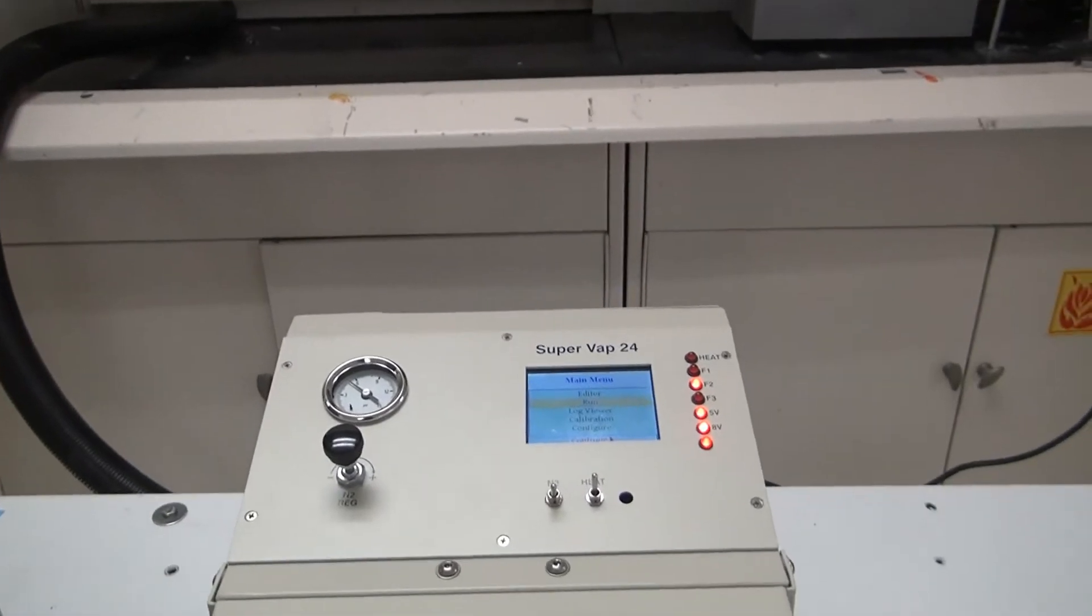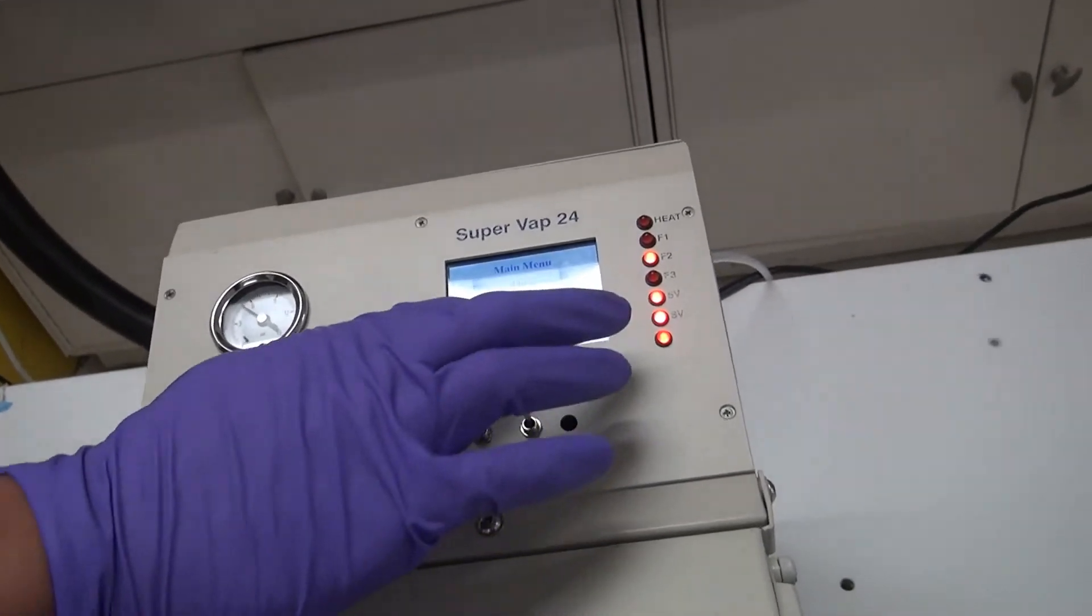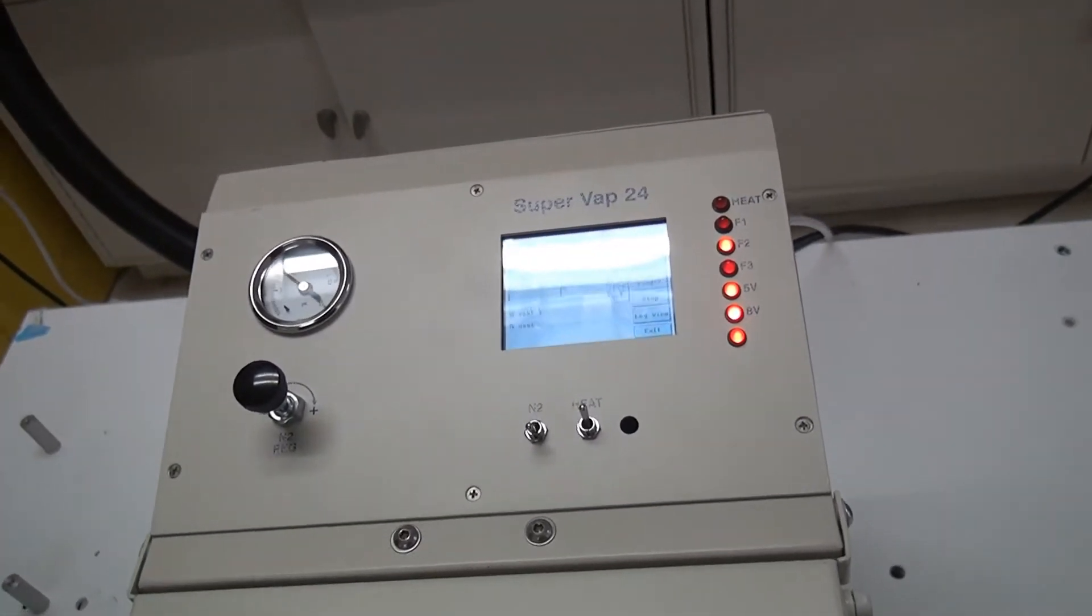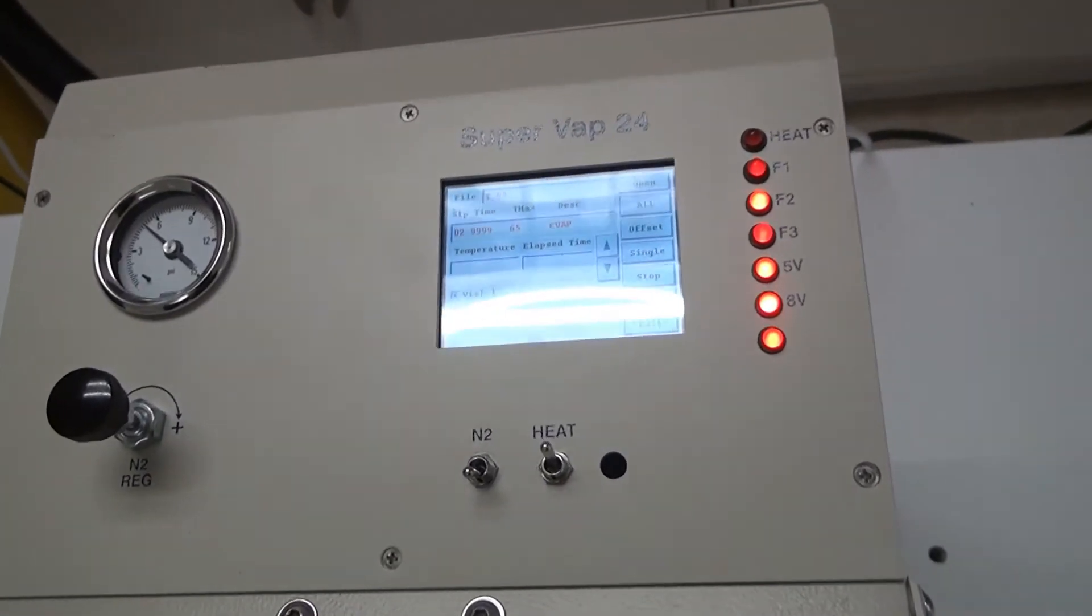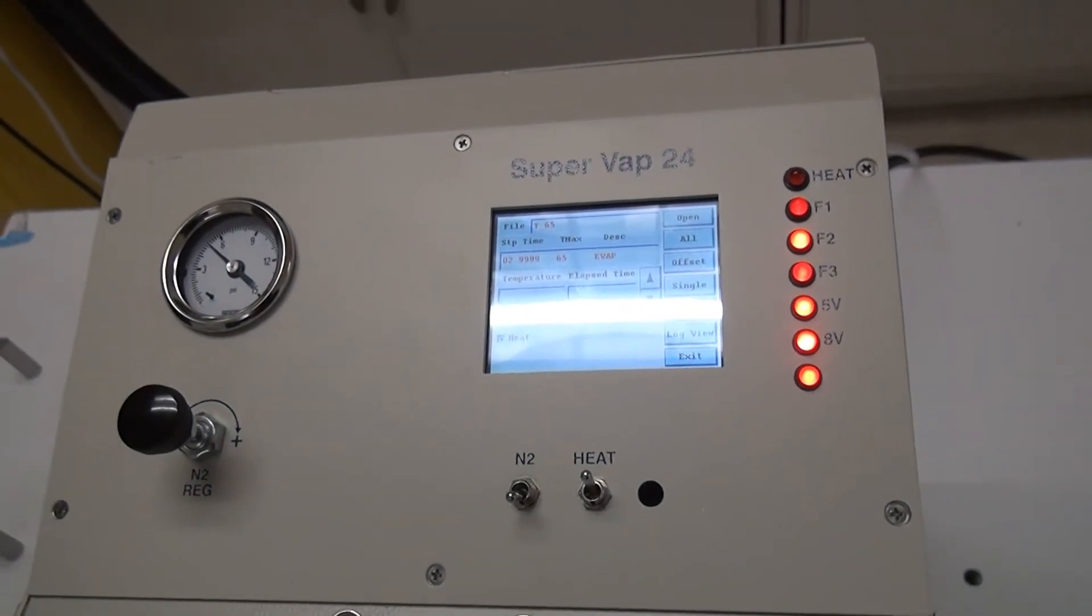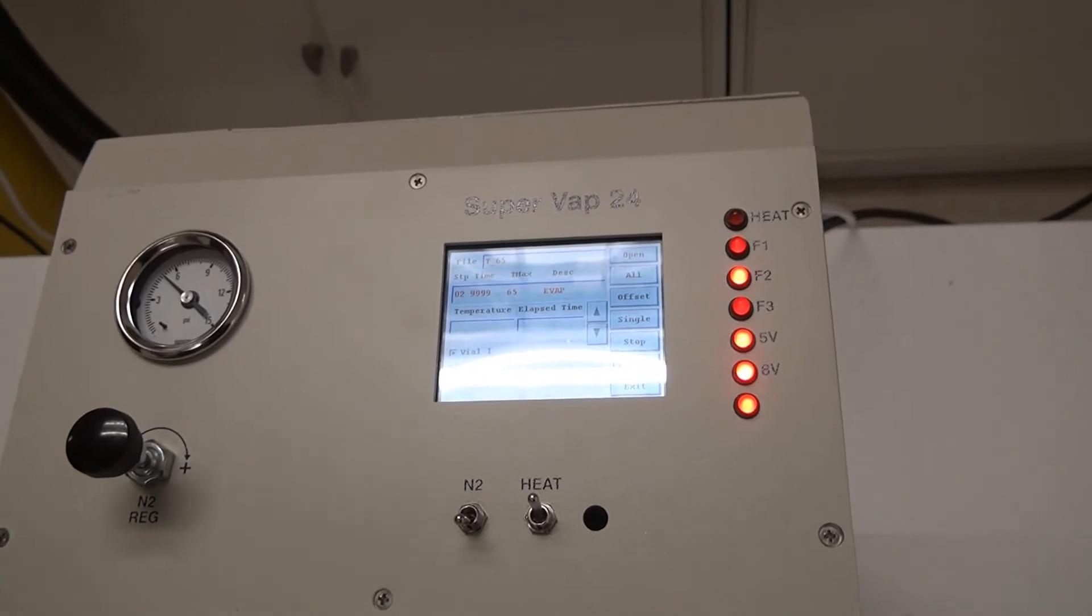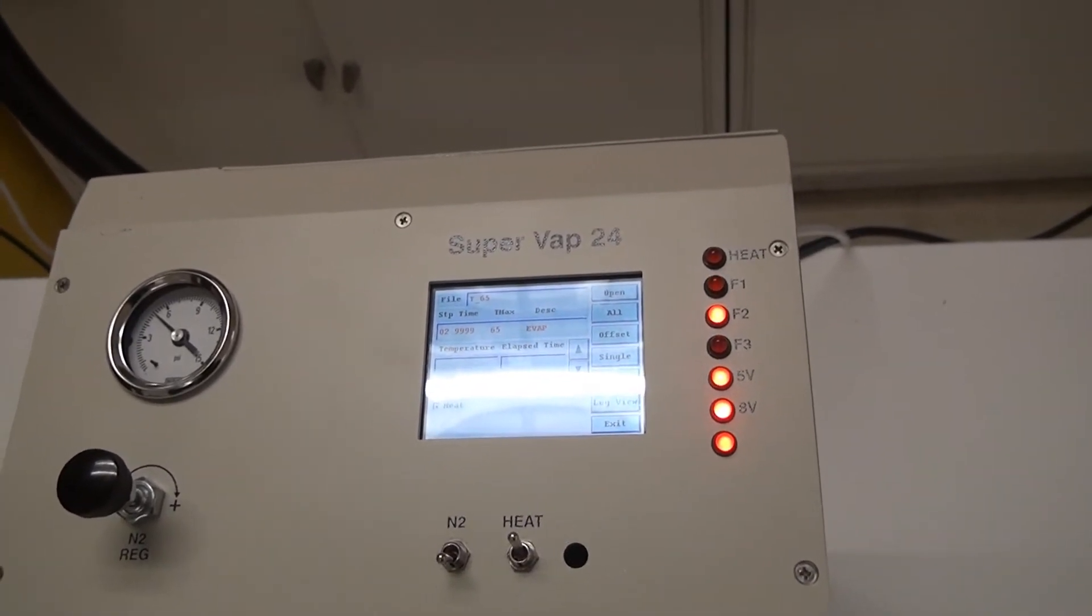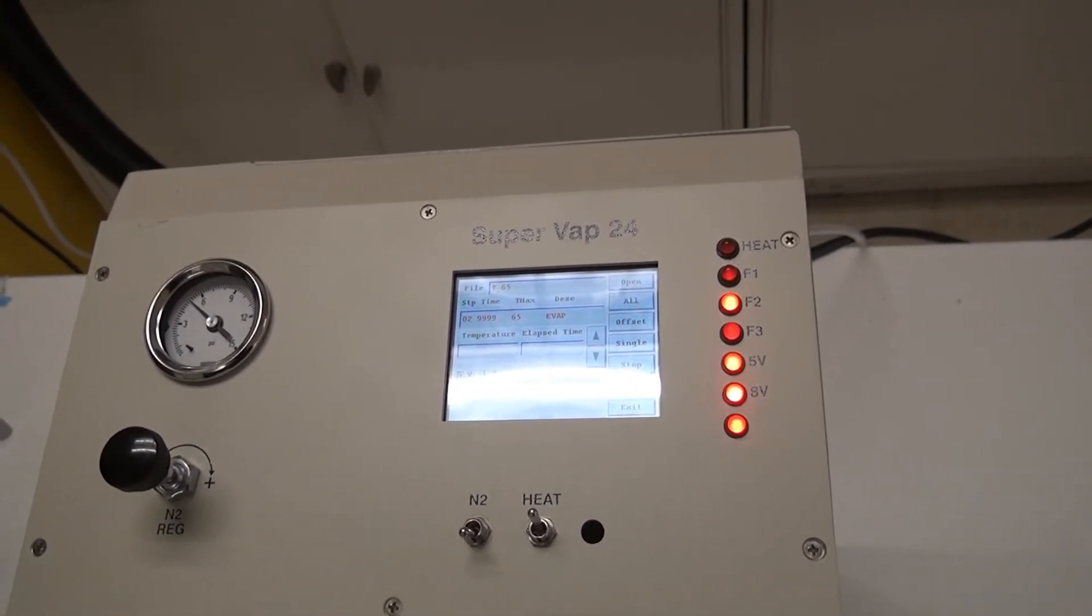And we also run at 65 degrees, so we just selected the run method and as you can see we have 65 degrees selected. We have temperatures from 35 to 80 pre-programmed here, so there's not really a lot of programming that you need to do.